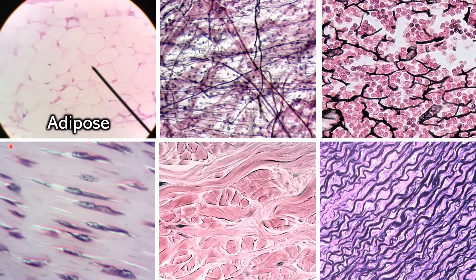The tissue next door: in the background you're seeing kind of out of focus thicker pink fibers, and in the foreground these black-looking fibers. This is areolar connective tissue. The defining characteristic is that you have these pink collagen fibers and the black-to-purple elastic fibers randomly arranged in many directions, and there's a lot of open space because areolar is a loose connective tissue. There are also usually lots of these little black dots, which are cells called fibroblasts.